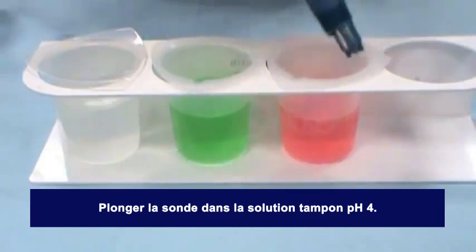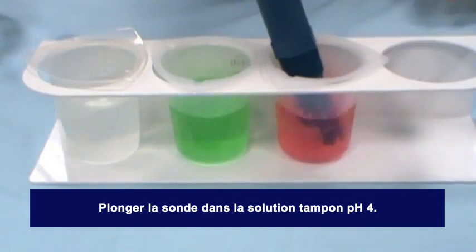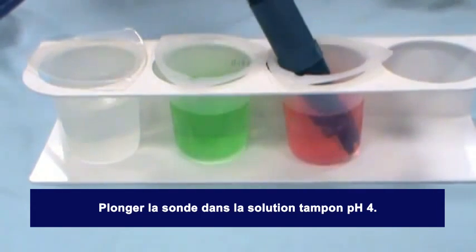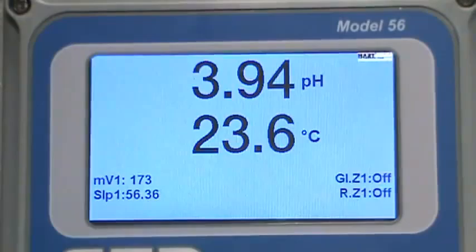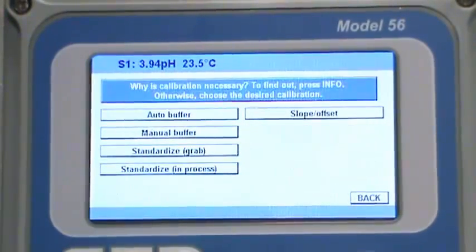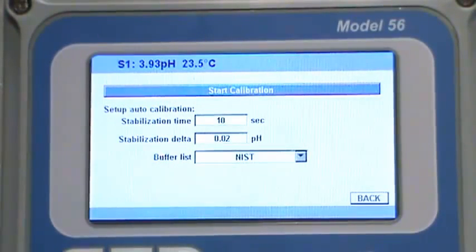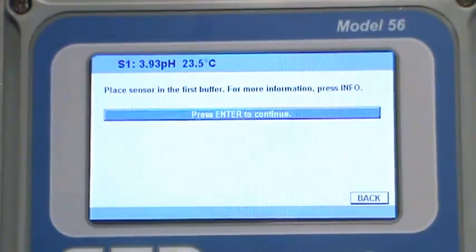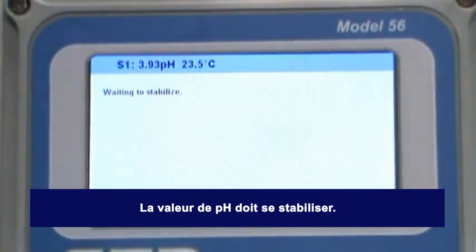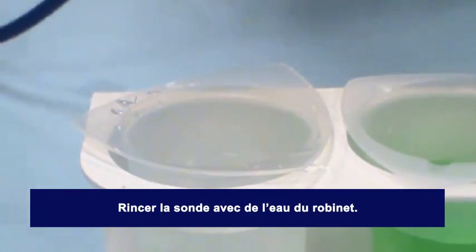Place the sensor in the first buffer solution. In this example, pH 4 buffer solution is being used. Wait for the value on the pH instrument to stabilize. If the sensor is not cooled to the same temperature as the buffer solutions, the stabilization time may take longer than expected, or the calibration may not be successful. Once the buffer value has been acknowledged by the instrument, remove the sensor from the pH 4 buffer solution.